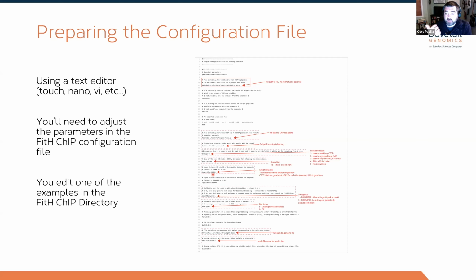But if you're doing something like H3K27 acetylation, POL2, or transcription factors, these things often work in a little bit smaller of a distance. So you maybe want to shrink that depending on your question or your protein that you're interrogating here. One thing that you should keep in mind here is that the distance should be at least bin plus 1 bin, right? So you don't necessarily want to go to the nearest neighbor bin. You're going to get a lot of data that's just short inserts that aren't going to really be informative there. So at least have it 1 bin size away, so you're capturing those interactions there.